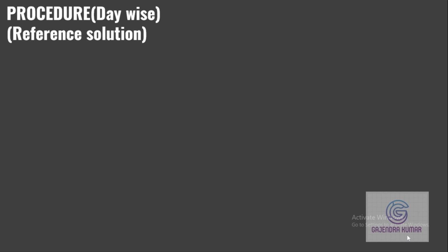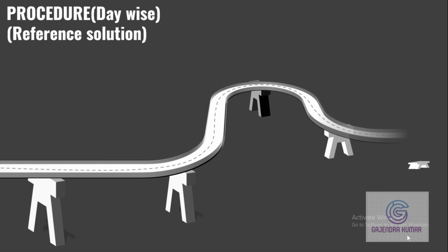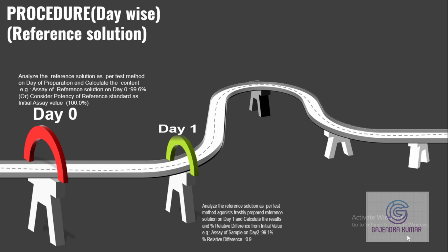However, you can take one advantage. In case of reference solutions, instead of performing the analysis on the day of preparation, you can consider the potency as the initial value, or you can perform the analysis also. My recommendation is to perform the analysis on the day of preparation. It will reduce your weighing errors and preparation errors, so there is a higher chance of giving accurate results on subsequent days.